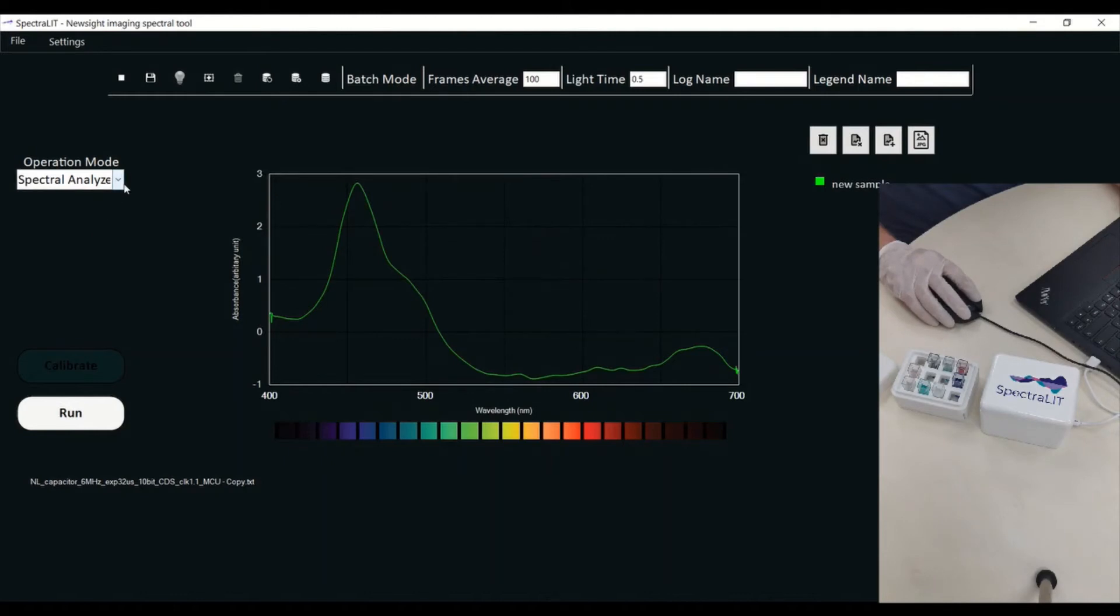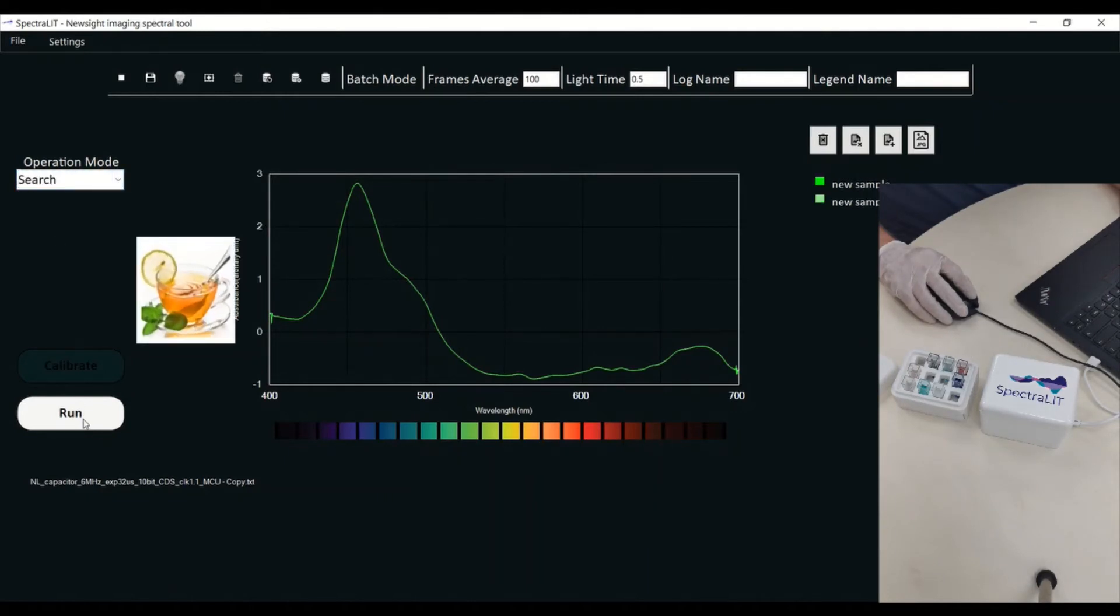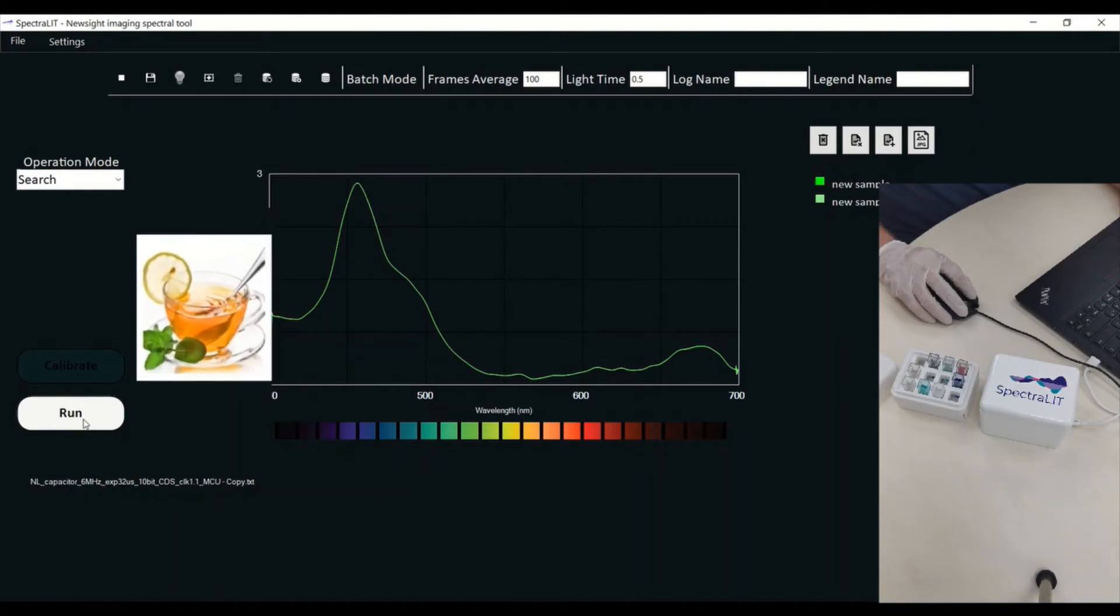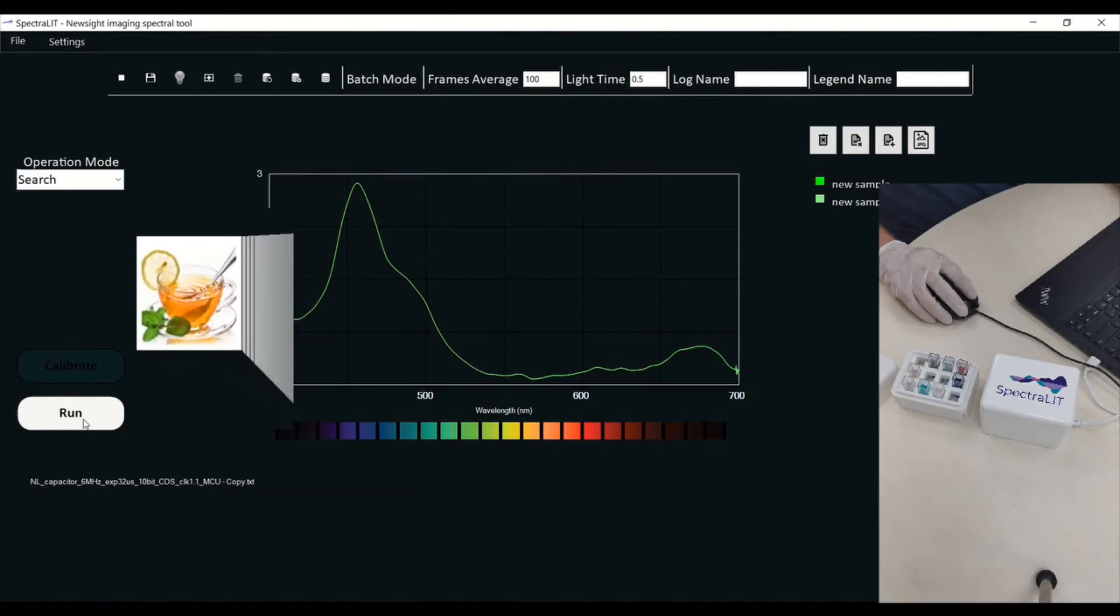Now I'm going to do a search because I want to see exactly what it matched to. And as you can see, it has something that I put inside my database which is Lemon T.